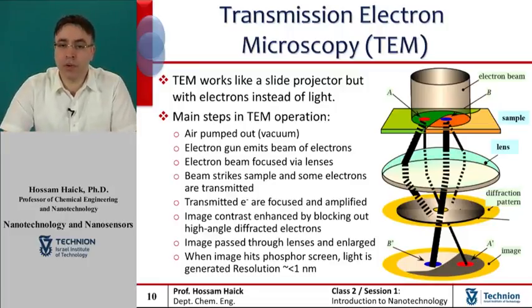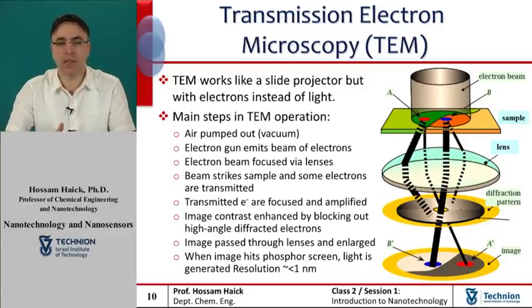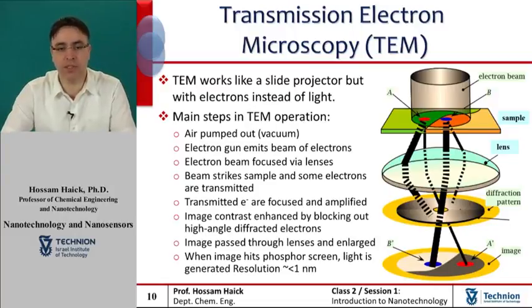There are 4 main components to a TEM: an optical column, or more specifically, an electron-optical column, a vacuum system, the electronics, and the control software. A modern TEM typically comprises an operating console supported by a vertical column and containing the vacuum system and control panels for the operator. The microscope may be fully enclosed to reduce interference from environmental sources and operated remotely.